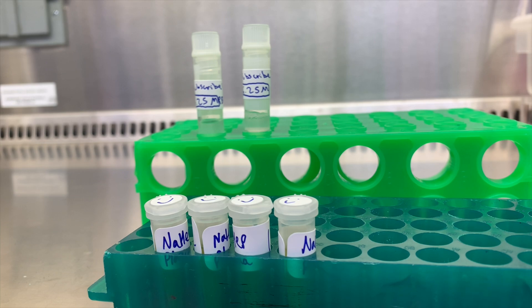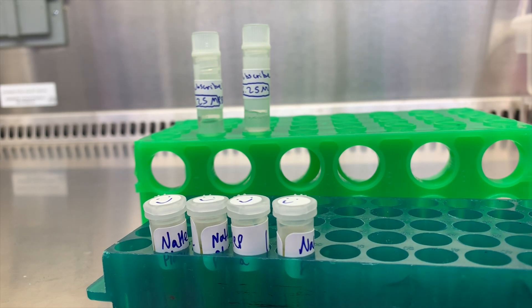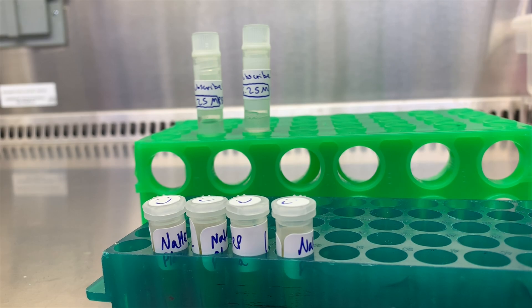We've successfully performed a Ficoll to isolate plasma and PBMCs from whole blood. Woohoo! Alright, but things don't always go as well as that one, so let's go over a few issues that you may run into.